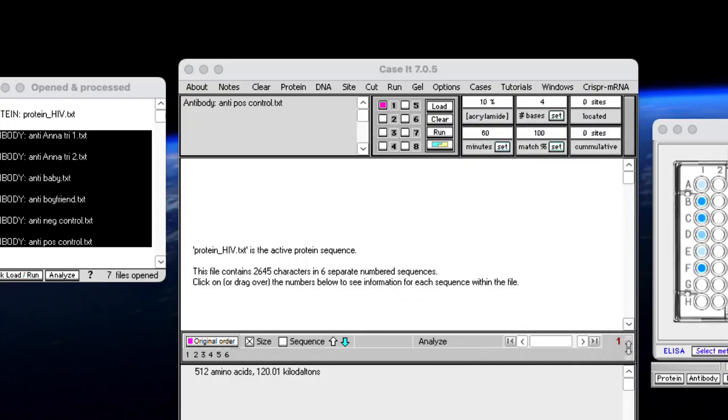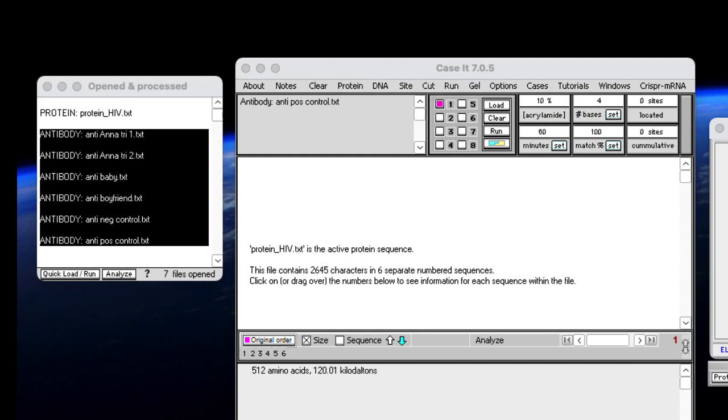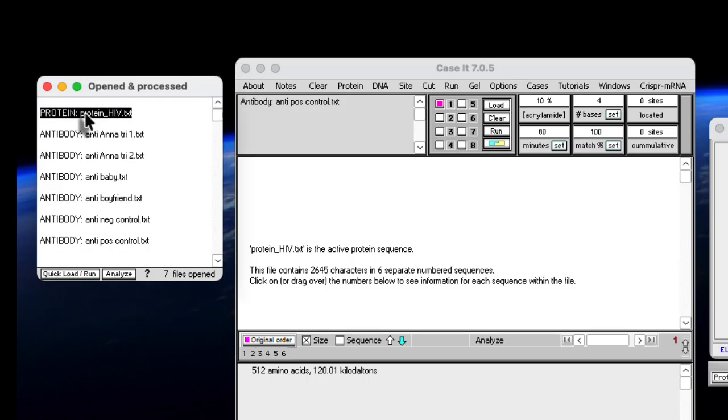And now I can very quickly run a Western blot. Again, I will demonstrate the auto load features. Go ahead and re-click on protein. You always want to redo this clicking before each procedure. So click on the protein to activate it.